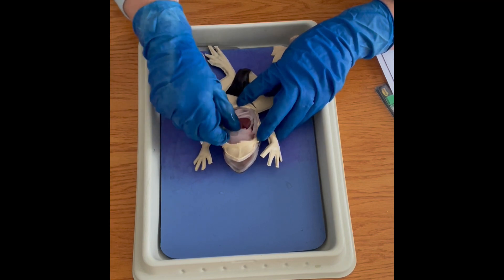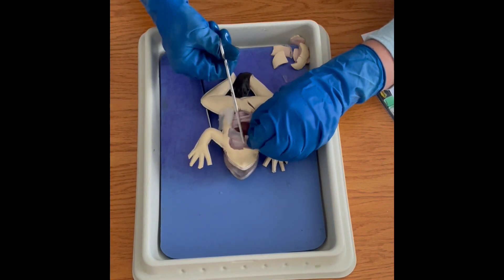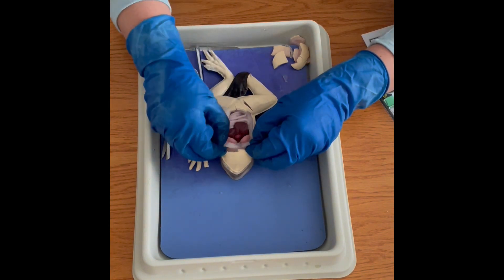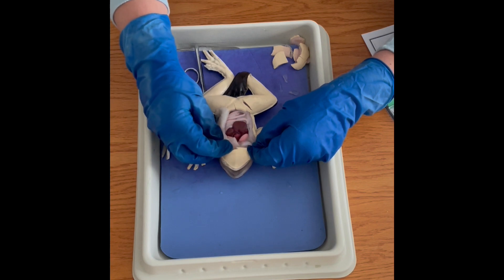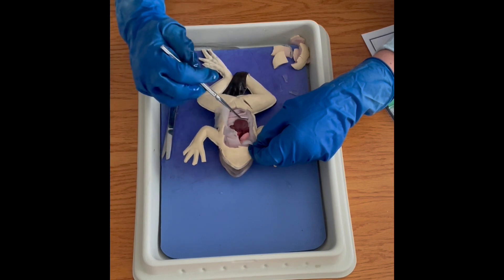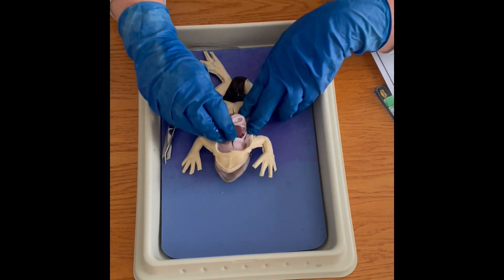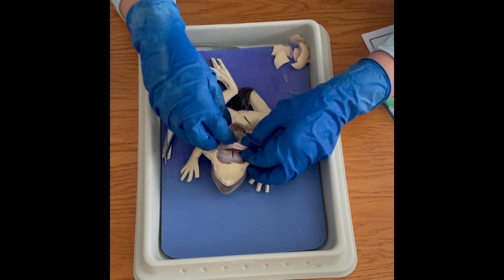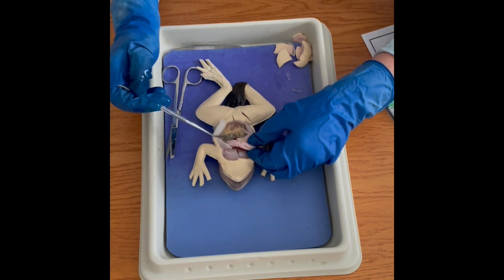You can see the liver in here, and as we cut up further towards the head you can see the lungs, which are actually a little bit easier to identify than in a real frog. The heart is in here, and then again the multi-lobed liver and intestines. The stomach should be in here as well — and yes, the stomach is in here. We've also got eggs in this one, just like you might find in a real specimen.